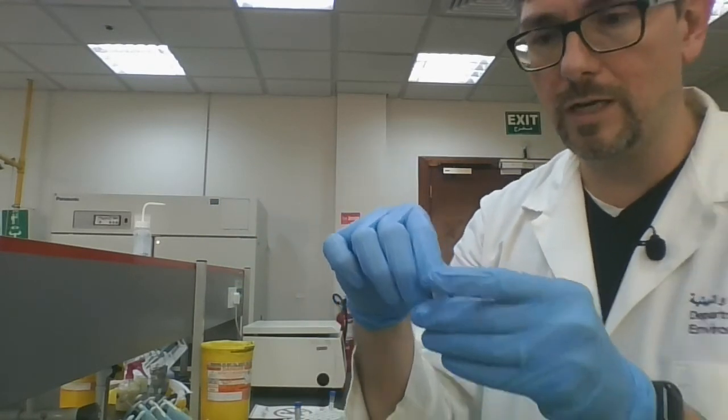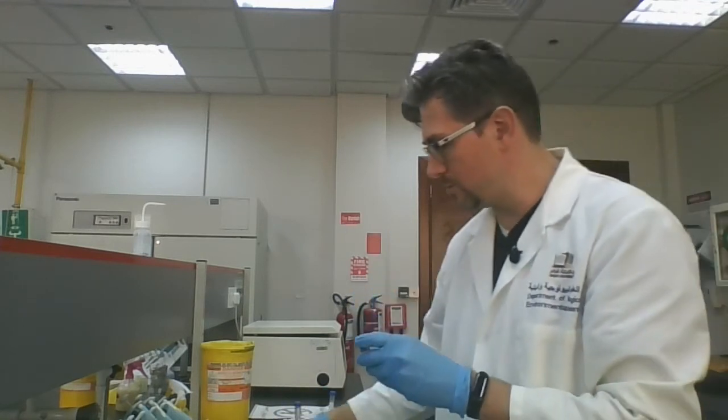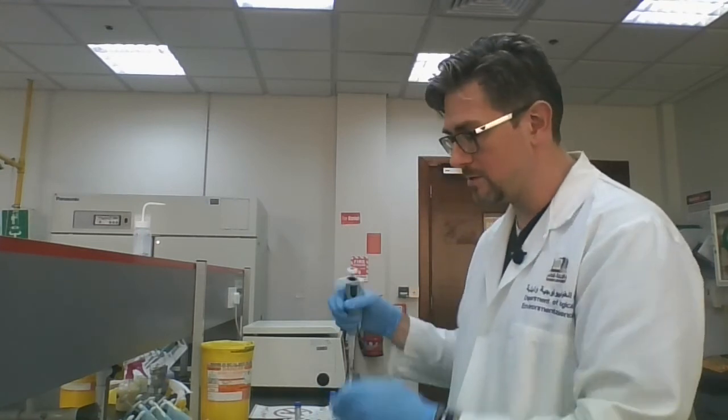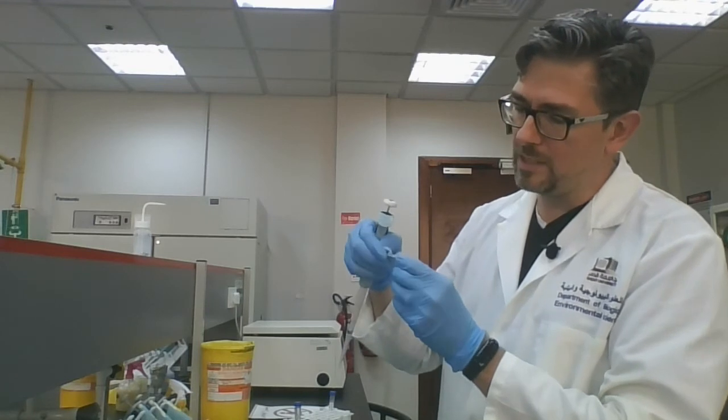So during the break, I was actually labeling my tubes, and I have fresh tubes ready to go. So I'm going to just transfer 400 microliters of this liquid into the new tube. At least I will try to transfer 400 microliters. We'll see how well that works. Usually it does fairly well. Now try not to pick up any of the pellet.